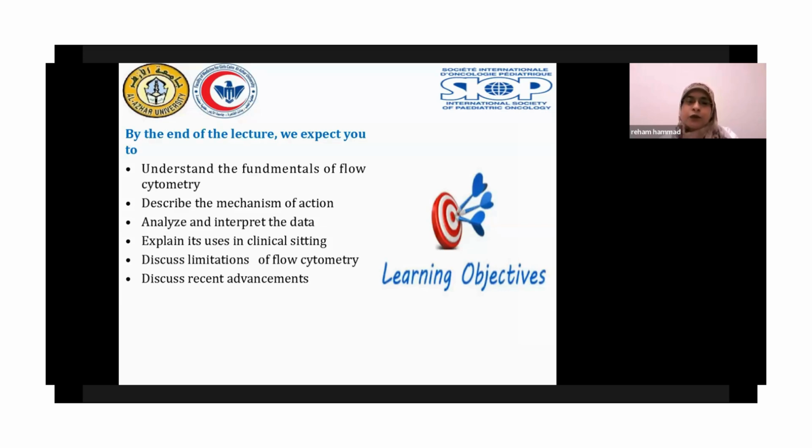the intended learning objectives of this lecture. Well, I do expect, inshallah, that after the end of this lecture the attendee will be able to understand the fundamentals of flow cytometry, describe the mechanism of its action, analyze and interpret the data coming from it, and also explain its uses in the clinical setting. Definitely, one session is not going to be enough, but we are going to tackle the important issues and discuss the limitations of flow cytometry.